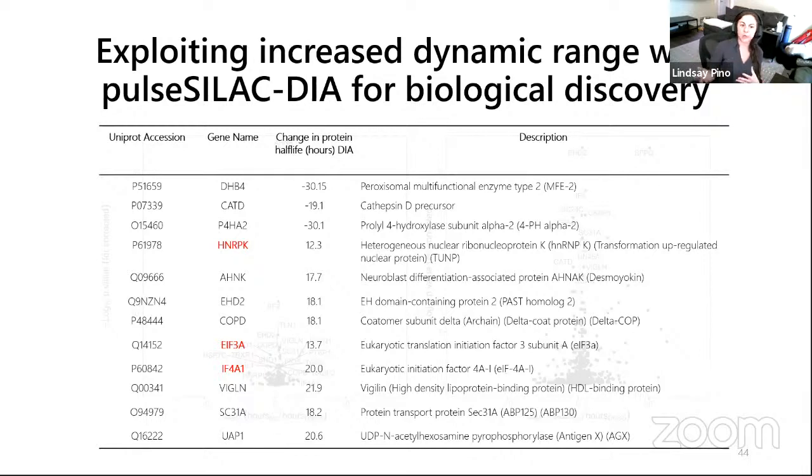Cathepsin D, this is also a precursor. Is this a proteoform that we're not capturing because we're just doing regular bottom-up quantitative proteomics? So could this precursor just have another form, another isoform that we're not really capturing well here? So this idea that even when we break down protein abundance into its component synthesis and degradation rates, there are still things functionally that we can't quite explain at the proteoform, at the functional level, kind of led me to some of my next work.